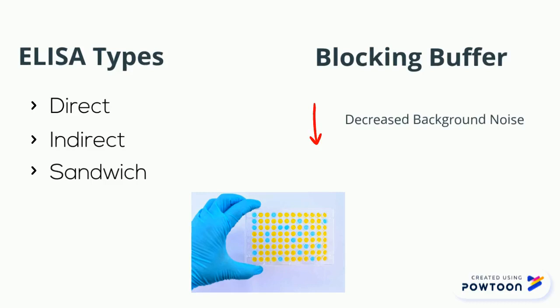Hopefully through this video you've learned the three different types of ELISA methods, along with the importance of the utilization of a blocking buffer in most ELISA procedures. Now remember in lab today, have fun!